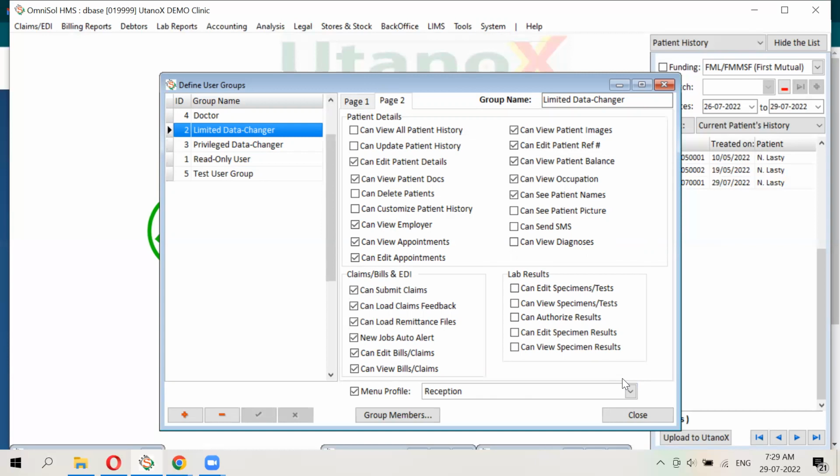Okay, so that challenge is sort of made inapplicable to our framework, because we build the whole platform on the assumption of a collaborative atmosphere where you have clinicians in different countries and even continents collaborating on clinical cases. So you'd have a doctor in India, in California, in Botswana, in Kenya, sharing notes and looking at the same case history of a patient.